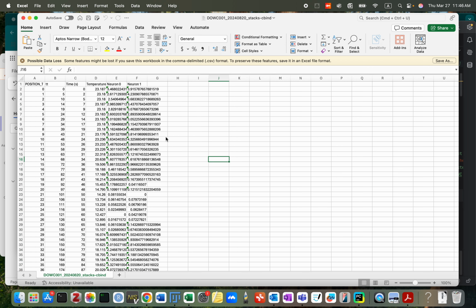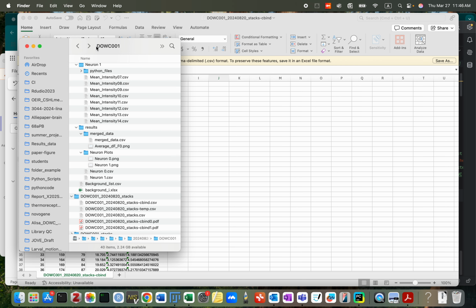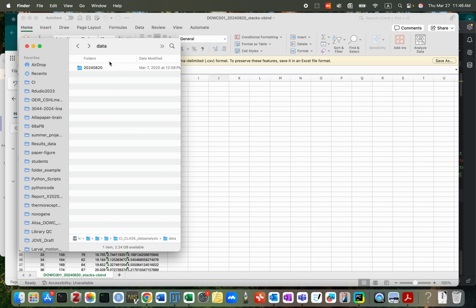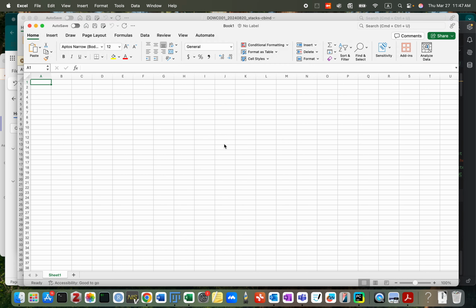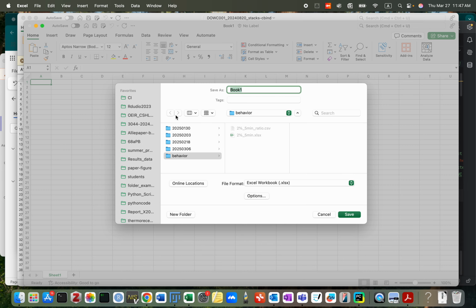Okay, next what we do is come to your sample folder. This is DOWC001. I want to go upper, and under the data folder you create a new Excel and save it there.